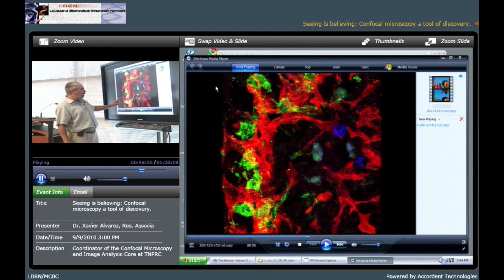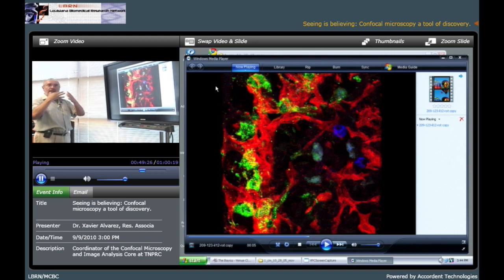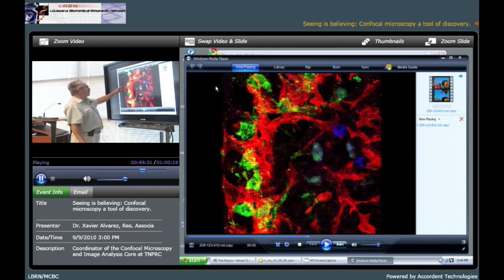This is a marker of monocytes that we use, and you can see these cells go there, and these cells are tessellated. I don't know if you remember the word from mathematics: they fit together perfectly, forming a very good basket. They don't allow anyone to pass without being checked.